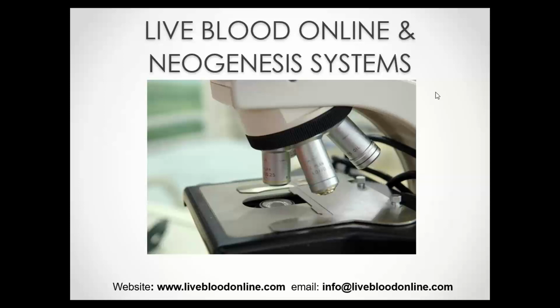Yeah, that's an important question. It's not used. Live blood analysis is not used to diagnose diseases. We really can't diagnose disease by looking at a drop of blood under the microscope, and that's not really what live blood analysis was developed for. And when it's used successfully in practice, the purpose of the test is not to diagnose disease.